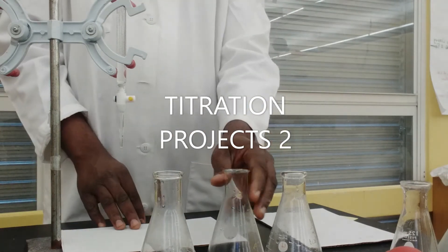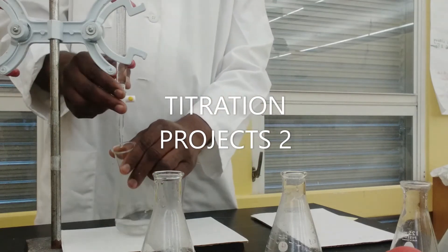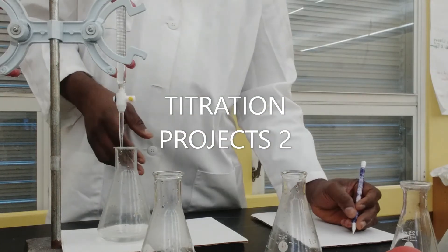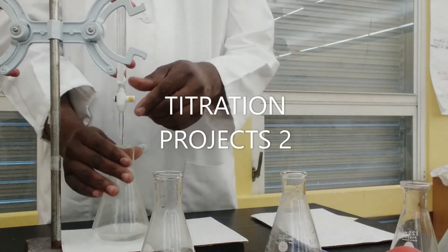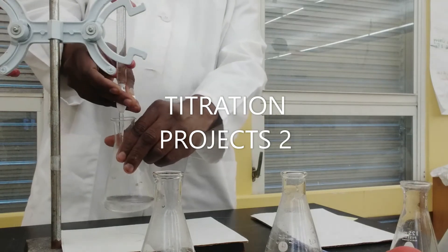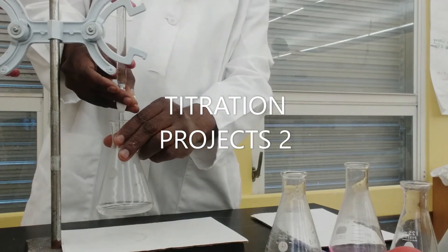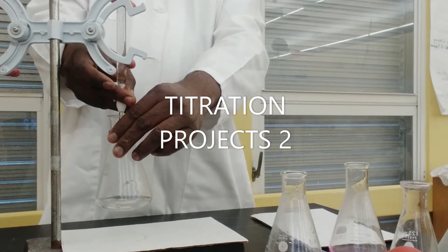I went from 0 to 1.5 milliliters, so I'll use that as my rough trial. For the second one I need to be very careful — I'm starting off at 1.5 where I ended the first one, and this time I want to be very careful because in the first trial the color changed very rapidly, so I'm just going to go slowly.